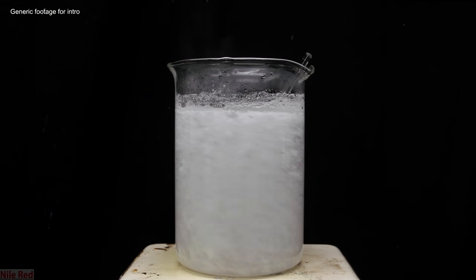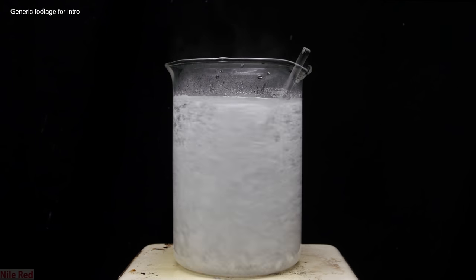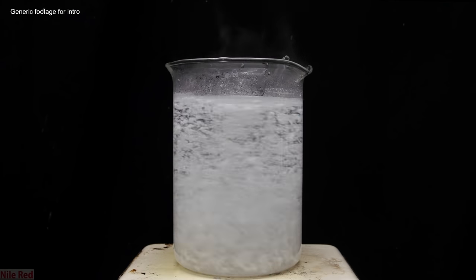These crystals, in theory, if allowed to form slowly and nicely should be very pure. So, what I described was the very basic premise of recrystallization, and now I'll get into the little nuances.